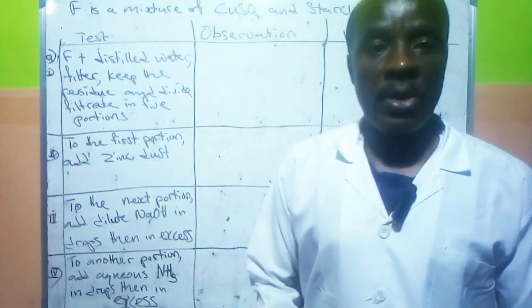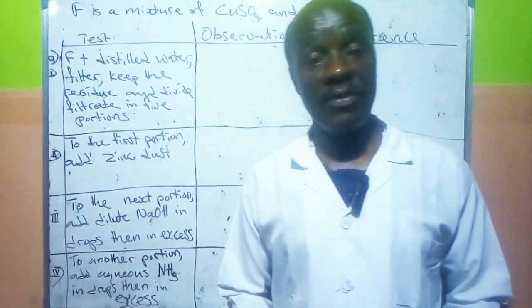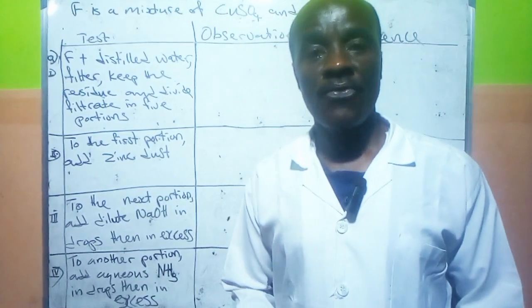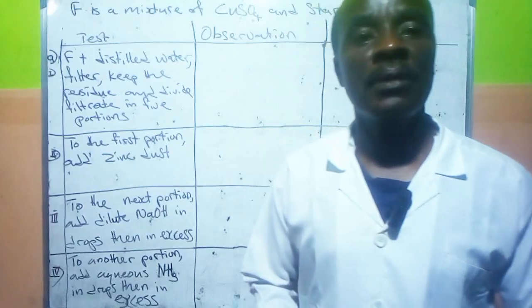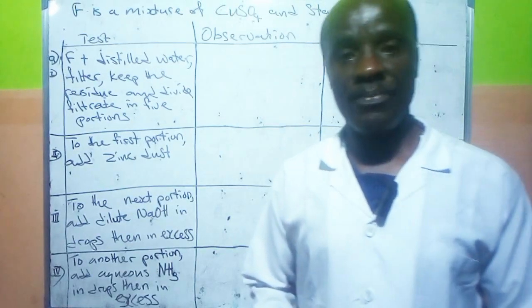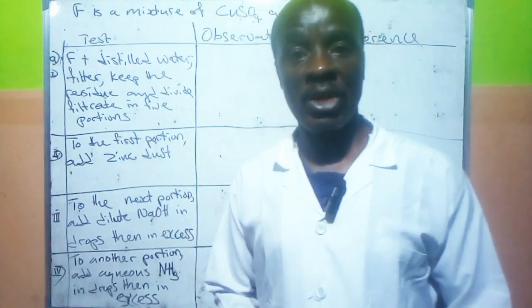So today we are going to be doing the qualitative analysis of this year's chemistry practical, alternative B.